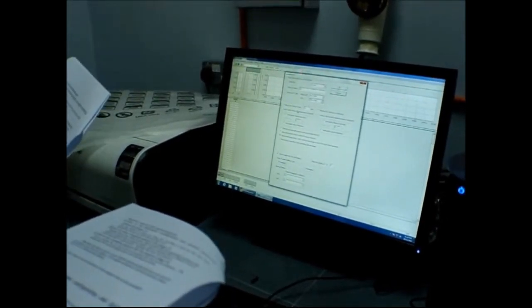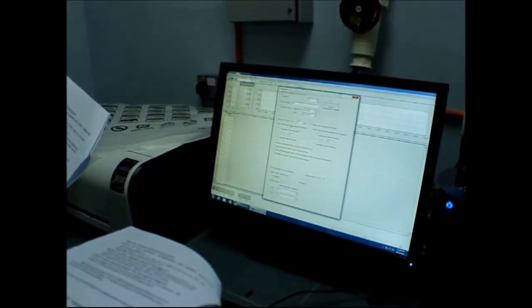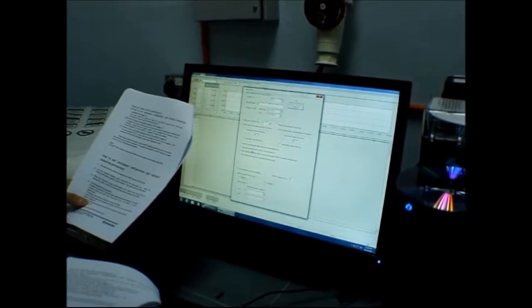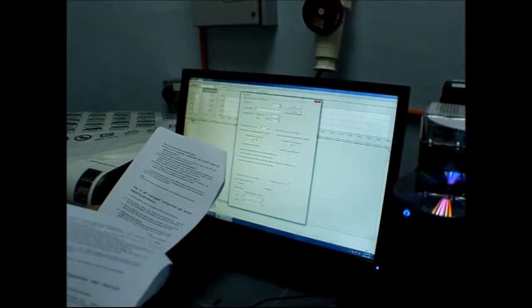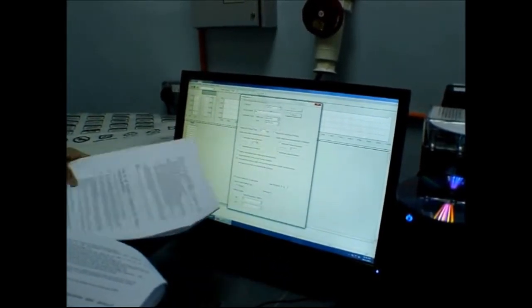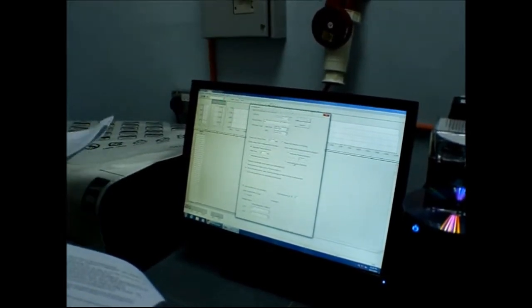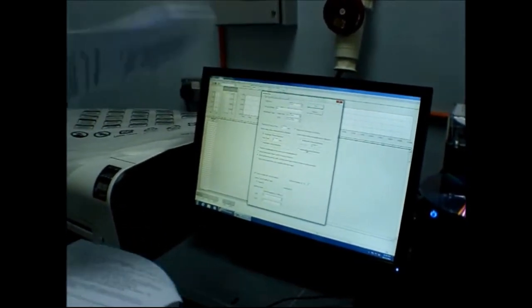So under action setup, when measurement is finished, check the box for automatic flame extinction. So you check automatic flame extinction. There, this one, check it. So no need to wait. That means after I finish, then it will automatically extinguish the flame.